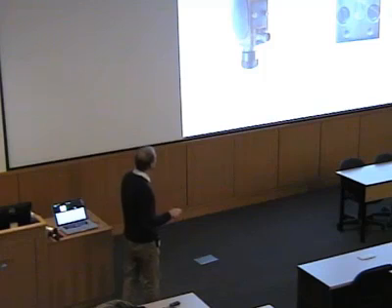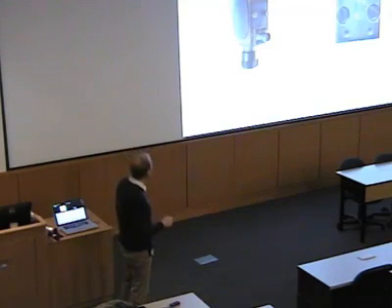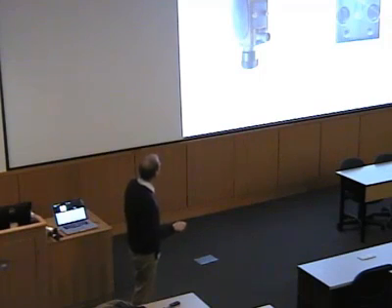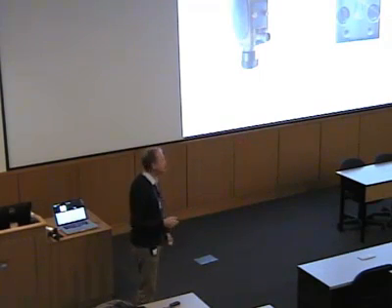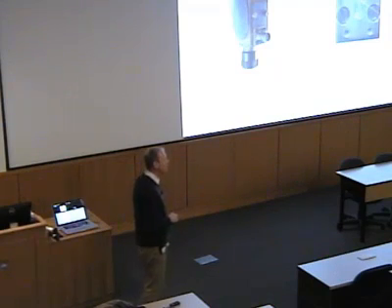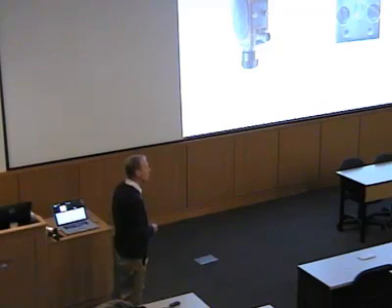Then there's a small screw here which has on the end of it a metal plate which couples the microwave into the resonator. A big part of any EPR experiment is to adjust the coupling by adjusting this iris to couple the resonator properly with the microwave source.